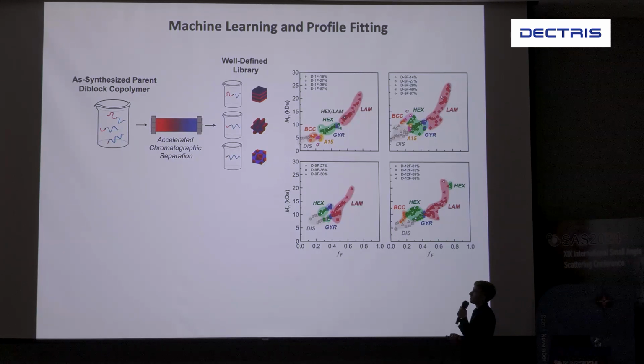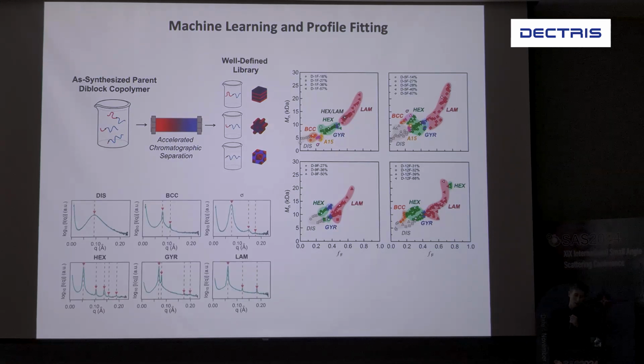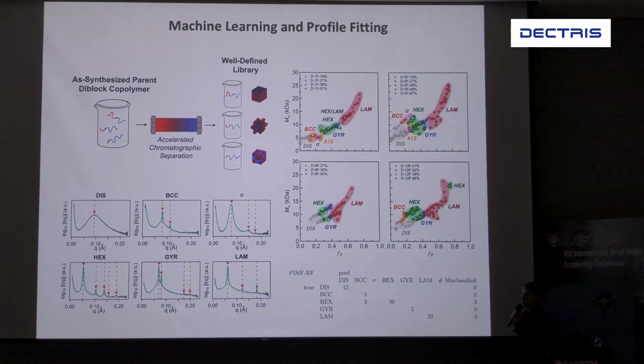The pro of this is that you're able to create your phase diagrams much faster because you're able to generate many, many more samples. However, the con is that you have to then analyze every single sample. So I helped the user create a basic machine learning program that looks for the peak positions and then, from the peak positions, deduces what phase it is. And it's to about 96% accuracy.